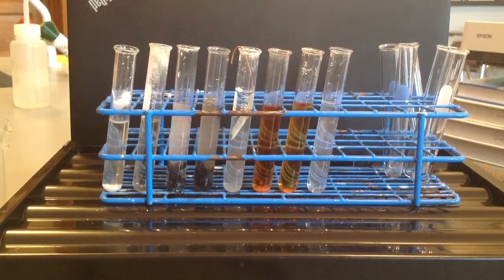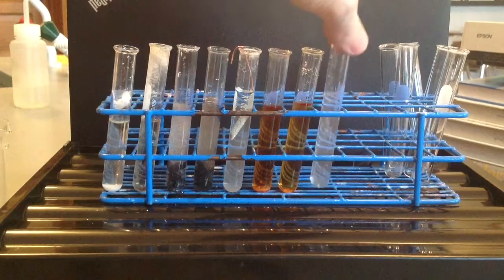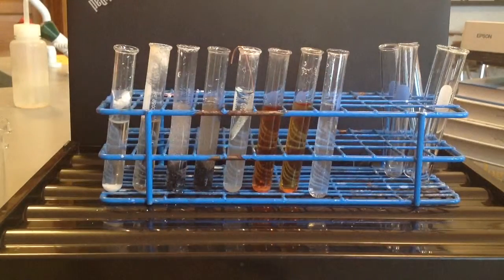Okay, so now we're moving on to step 7. We are not doing step 6. We'll be skipping that step. And so I have a test tube already set up with the silver nitrate in it, which is this test tube right here. And so what I'm going to do is add dropwise some sodium chloride solution to this test tube. All right, so let's see what happens here.